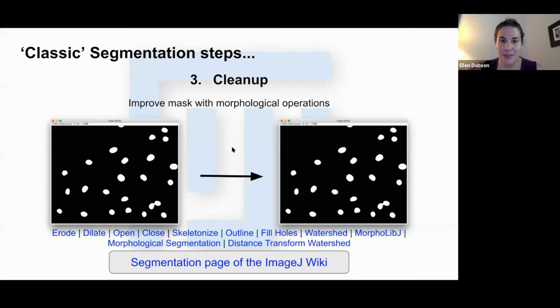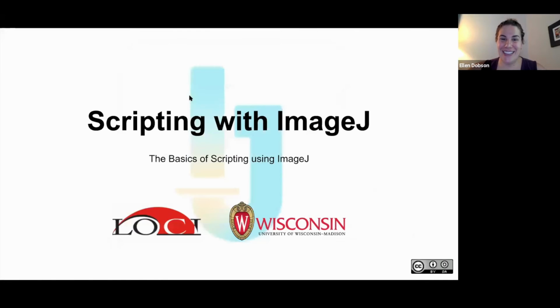Okay. We good? Okay. Let's go ahead with scripting then.